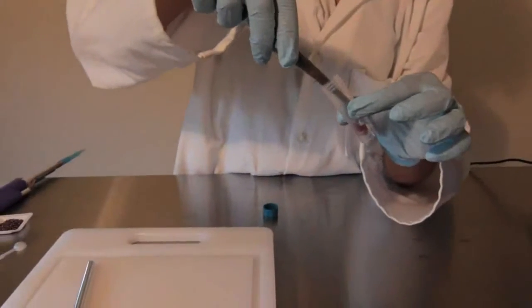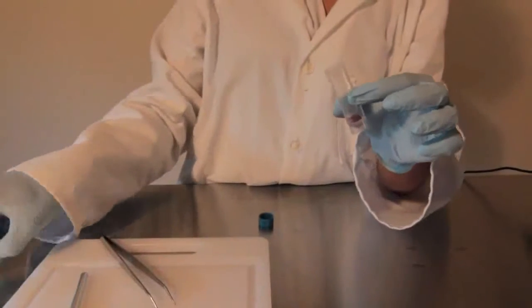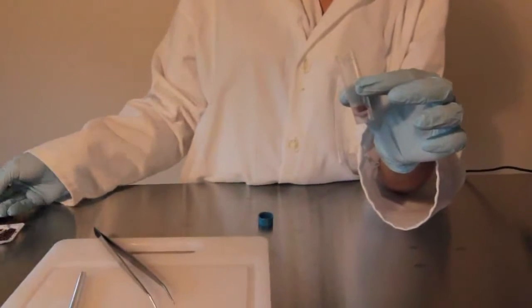First, place the sample in the bottom of the tube. Don't stuff it down there because you want the tissue to be able to move around inside.